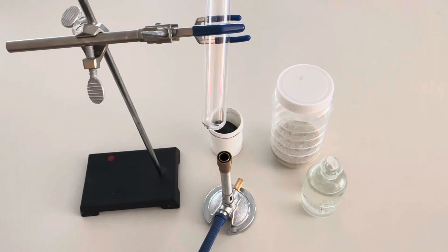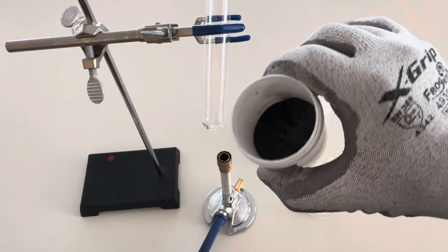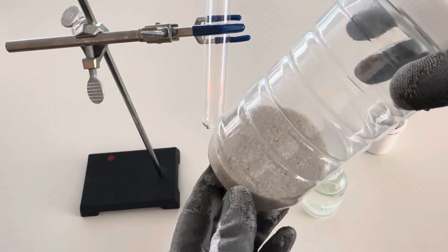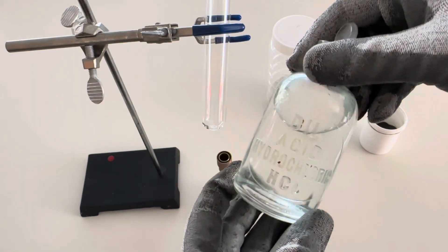All I'm using to make my pyrophoric silane gas is my Bunsen burner, a test tube, powdered magnesium, sand — also known as silicon dioxide — and 12 molar hydrochloric acid. The first step is to create magnesium silicide by combining magnesium powder and sand.